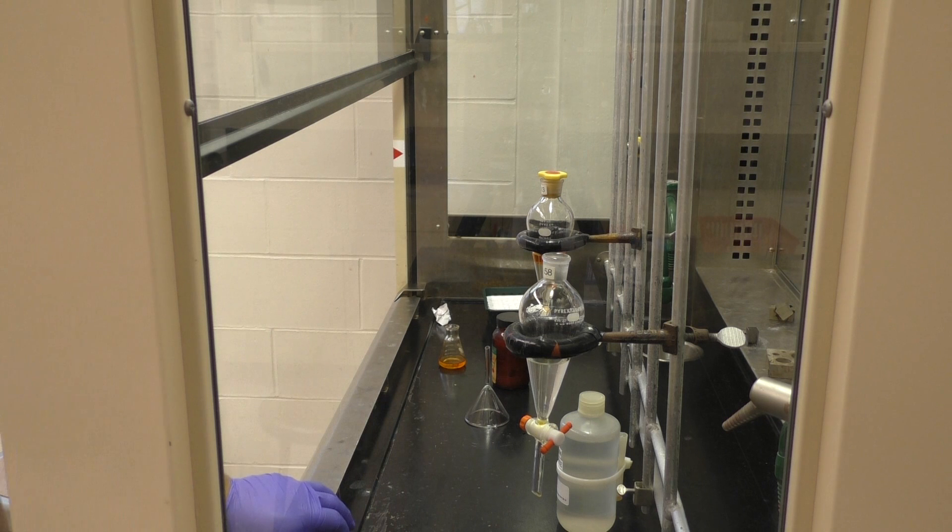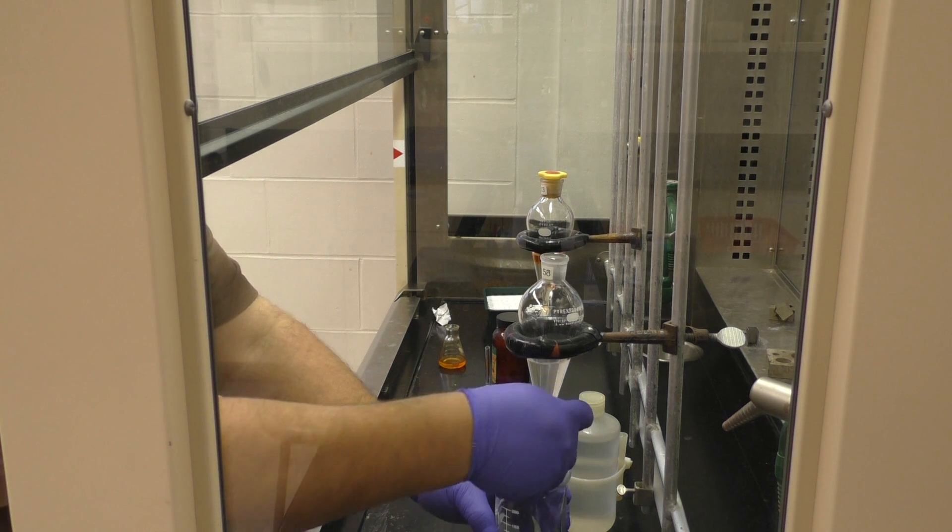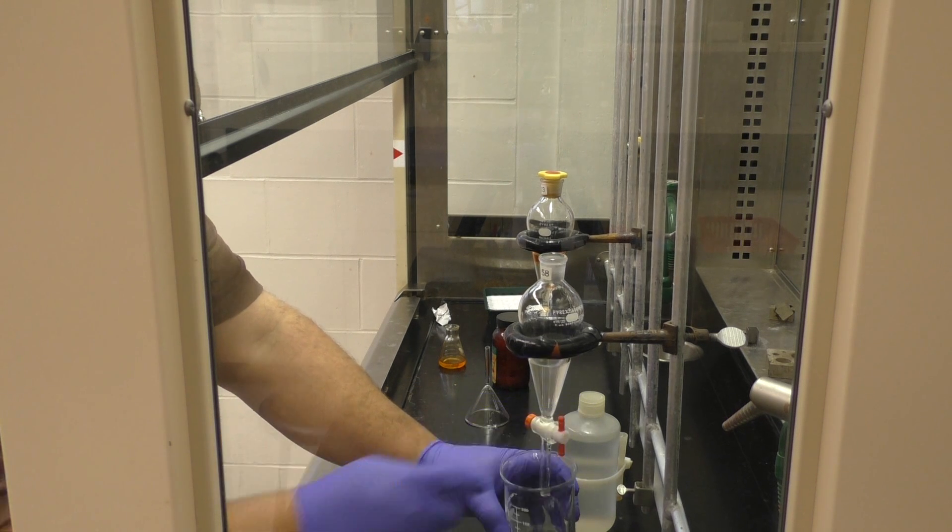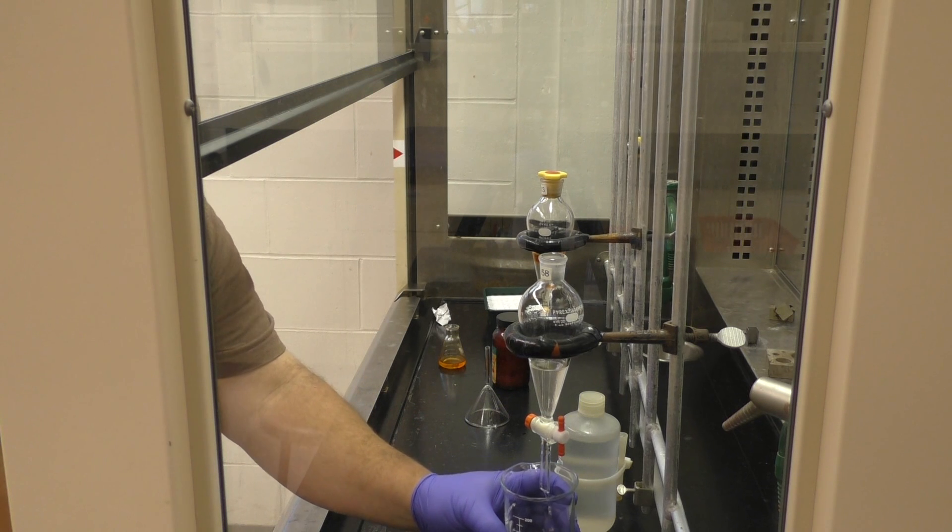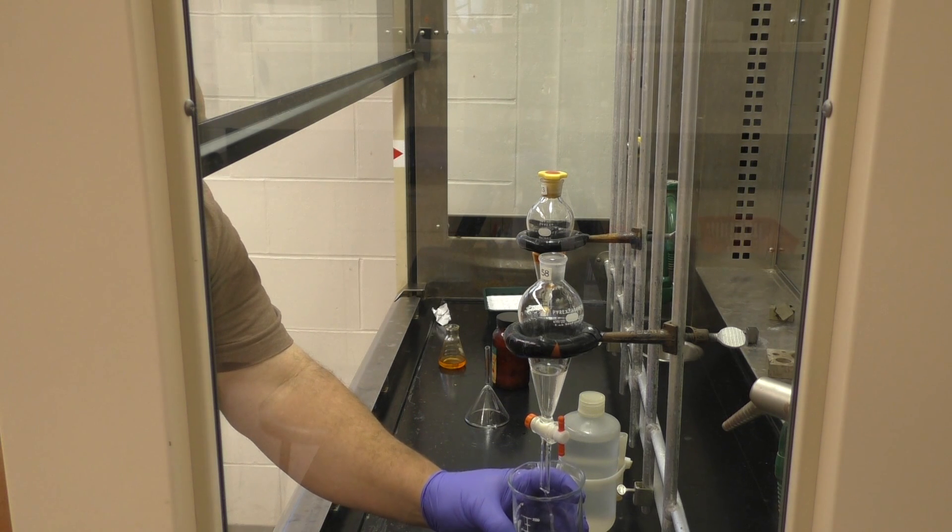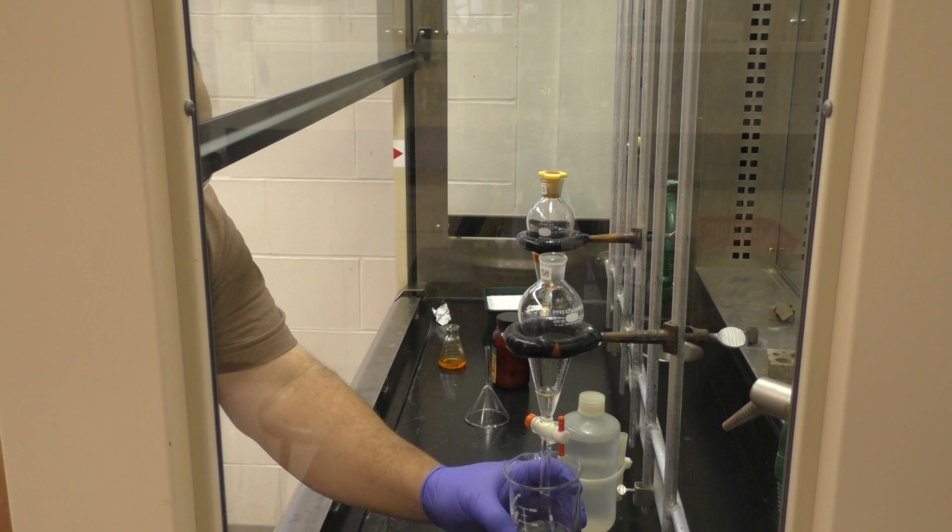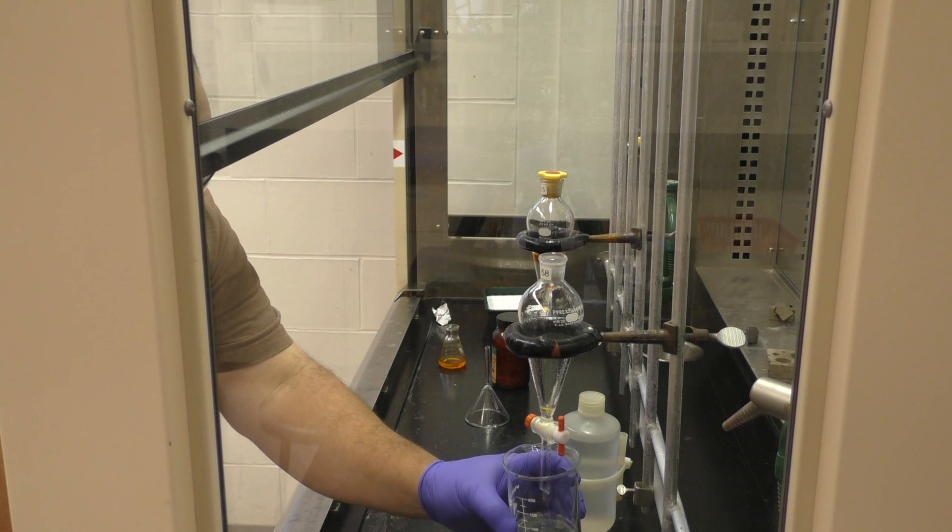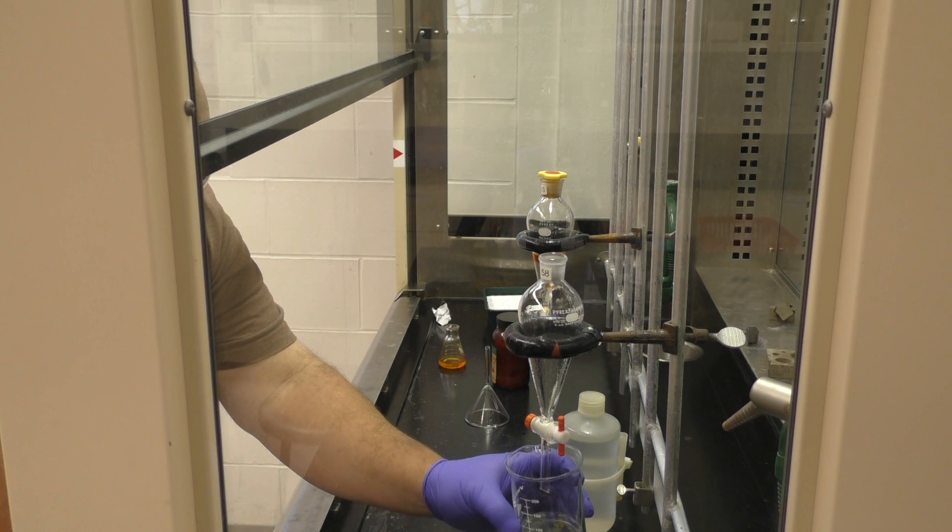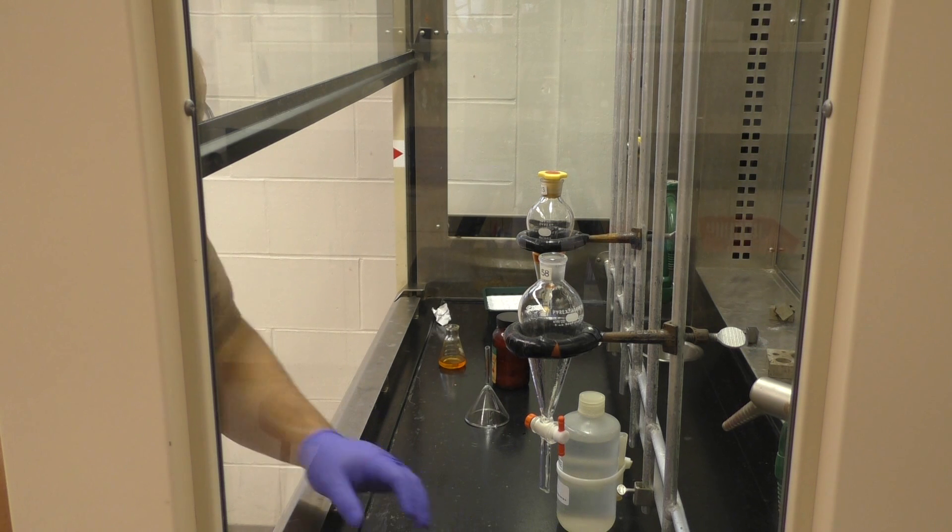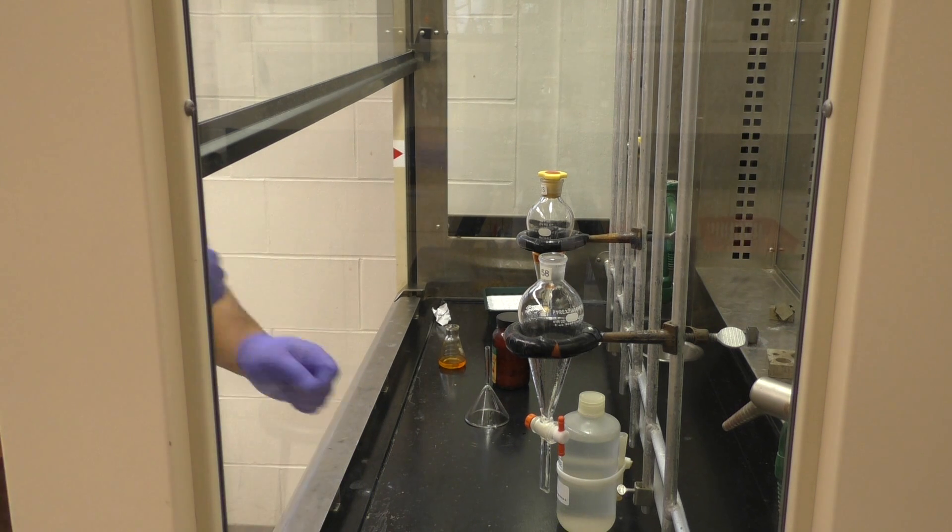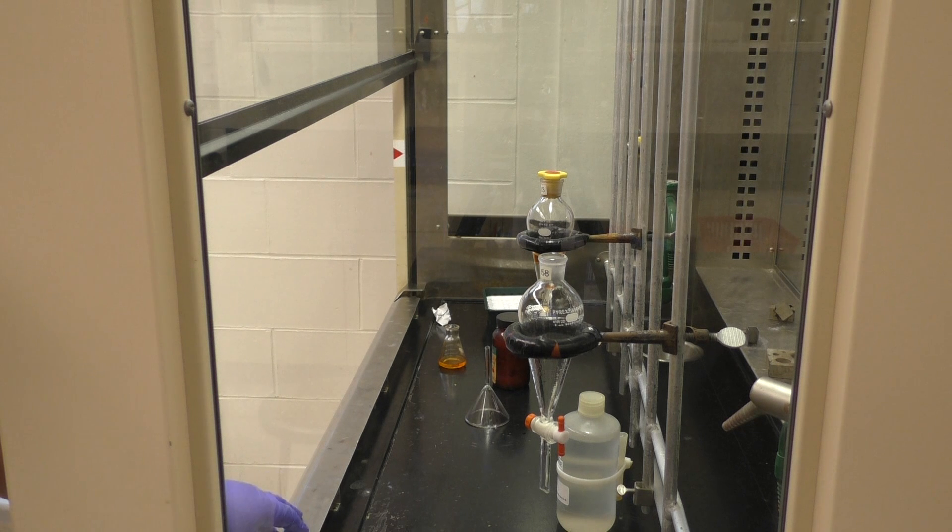Then you go get another vessel, collect all the aqueous, including the little bit of organic that was left behind. And that's the way you want to go about it. Make sure you do hold that vessel up close to the sub funnel because it does not drip straight down. And again, part of the mess in the hood, you can easily contain it if you do things that make sense.